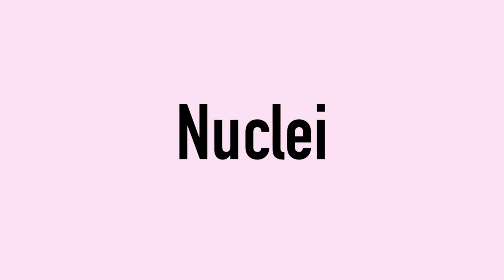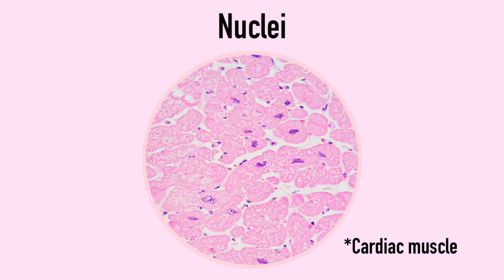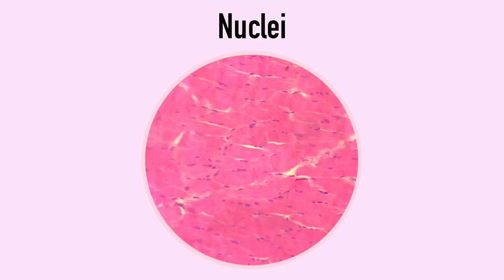Skeletal fibers are multinucleated muscle cells. In the hematoxylin and eosin staining method, nuclei appear as dark violet or purple flat ovals. Unlike transverse section of cardiac muscle where nuclei appear central, nuclei on a transverse section of skeletal muscle appear peripheral.